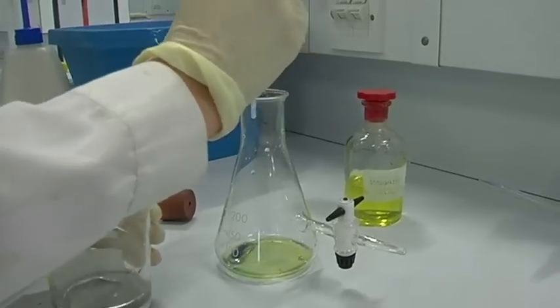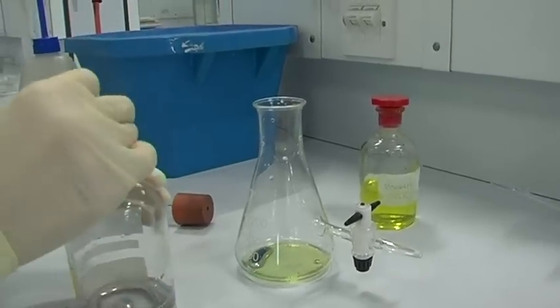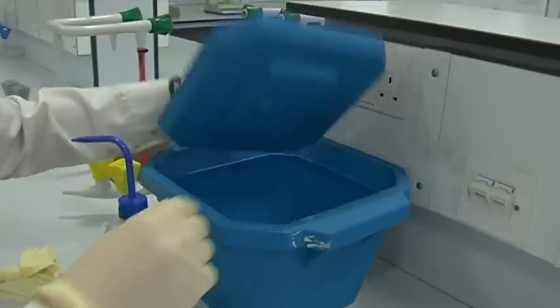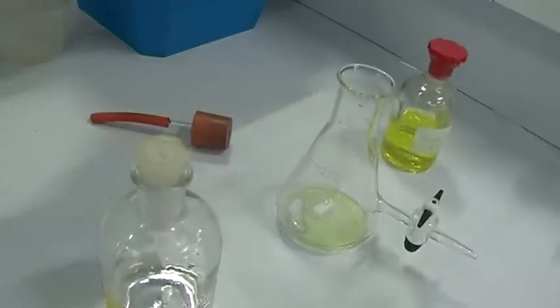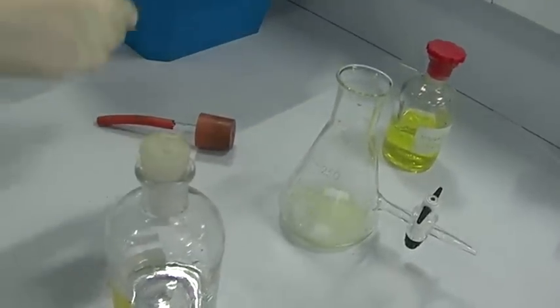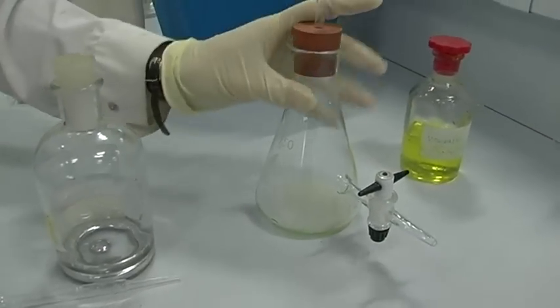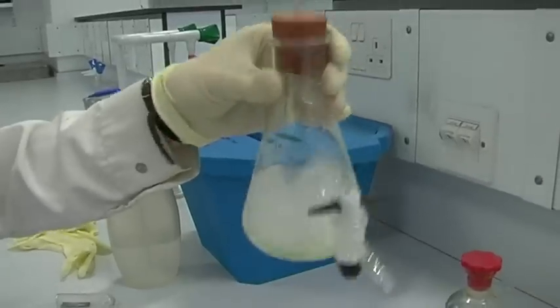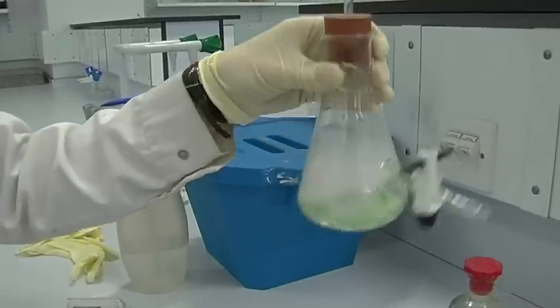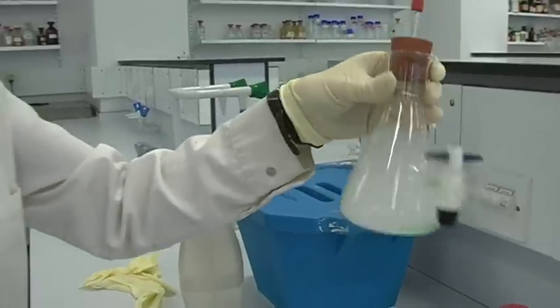Because I'm going to try and get down to a really low oxidation state, I need to make sure there's no oxygen at all in the flask. So I put some solid CO2 in which will then push out all of the oxygen. I'm going to have to swirl it for quite a long time. You can see it's changing to a green color.